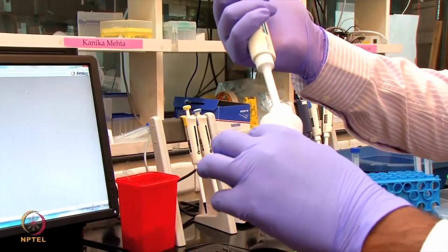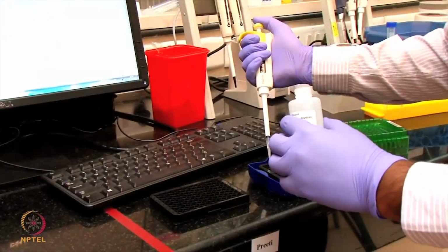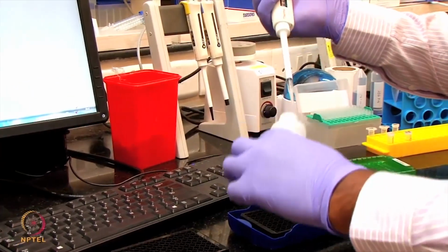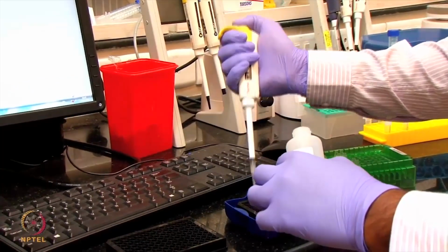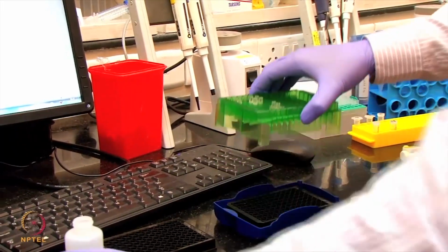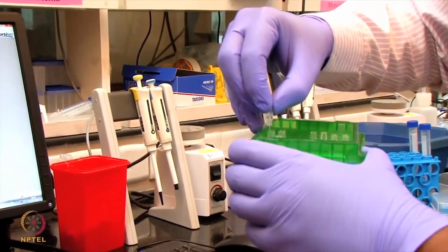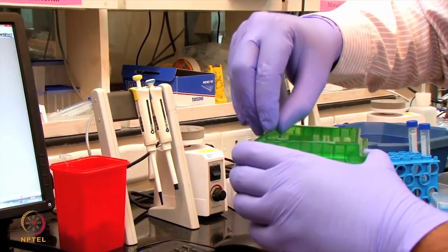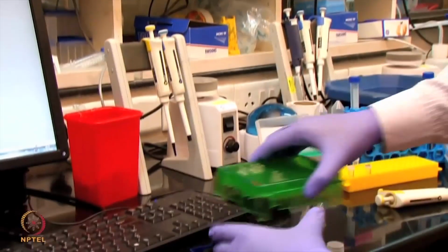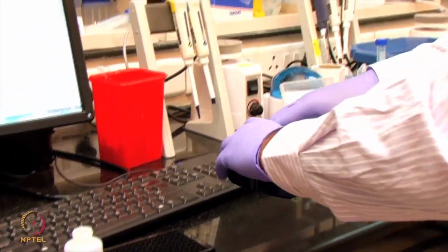Here I am going to take 200 microliter of this PBST buffer and add it here in A2 and B2. So now the sensor position I'm changing from A1, B1 to A2, B2, and I will start the equilibration of the sensor with this particular buffer.